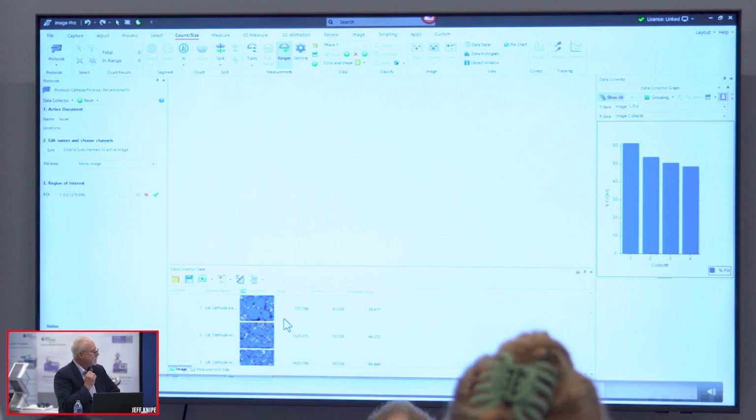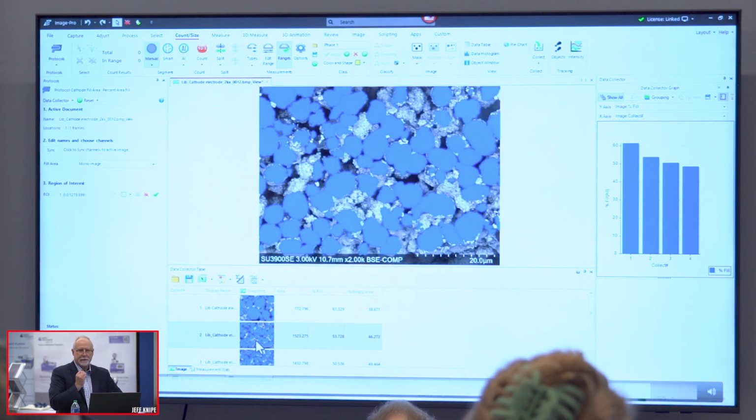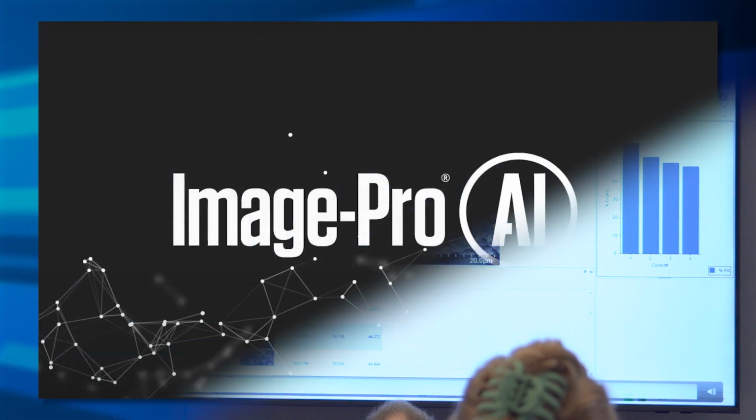You can review them. If you double click on it, it'll actually show the snapshot. Again, that can all be exported. And we have different data displays, pie charts, graphs, bar charts, heat maps.